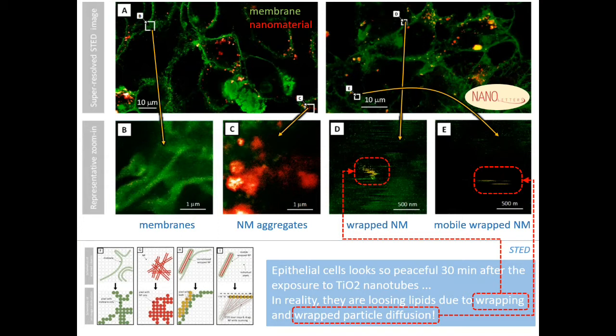This is a high definition, high resolution image of almost 80 megapixels, where one pixel is 10 nanometers. We are using high resolution fluorescence microscopy, which allows us to see details that are normally missed by classical confocal microscopy.